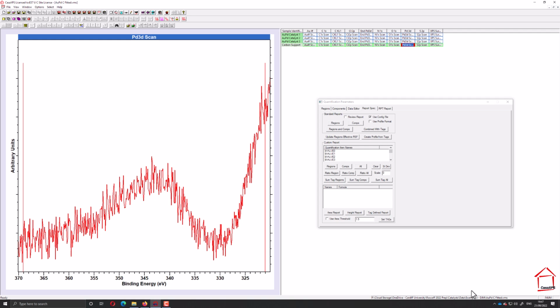Now, we want to model this, and there's several ways we can remove this from the data. We could do spectral subtraction, but that can introduce artifacts if we don't do it good enough. We can try and pull out different peak models from these data sets, perhaps using PCA analysis. Perhaps we might need more data sets for those.